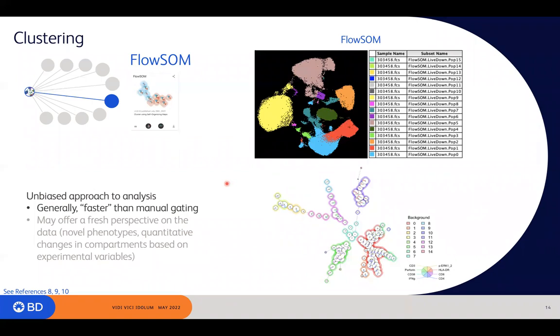The perfect example of this, I think, is cells that have mid-expression for a given marker. It doesn't have to be a cell surface marker. It could be cytokine. Oftentimes when we set up our 2x2 gates, we're gating everything exclusively as plus or minus: this is in, that's out. But the algorithm has the ability to visualize the data essentially in all dimensions at the same time. And so a lot of these mid-expressing populations are distinct, not in the mid-expression of the cytokine, but perhaps along some other cell surface marker.